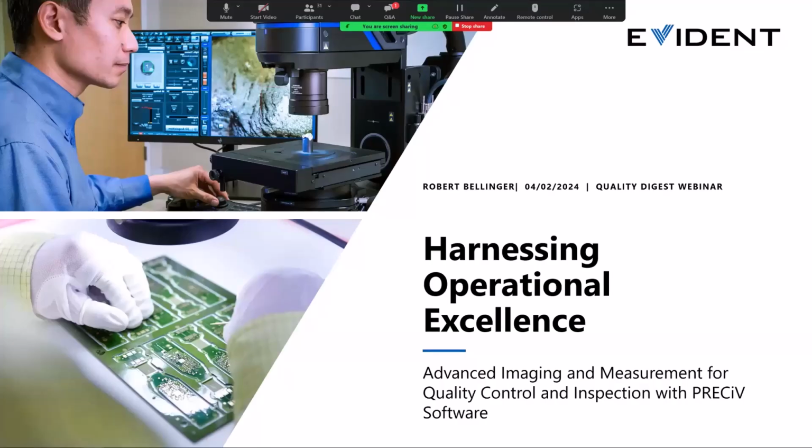Today, we're going to take an in-depth look at PRECiV analytical software, which now enables seamless control of Evident's advanced DSX-1000 digital microscope. We're going to review the system's imaging capabilities and intuitive controls with an emphasis on showing how you can maximize the software's capabilities for precise material evaluation. PRECiV software enables advanced analyses, including grain analysis, and unlocks a suite of specialized features tailored for semiconductor sample imaging through its innovative Wafer Navigator solution.